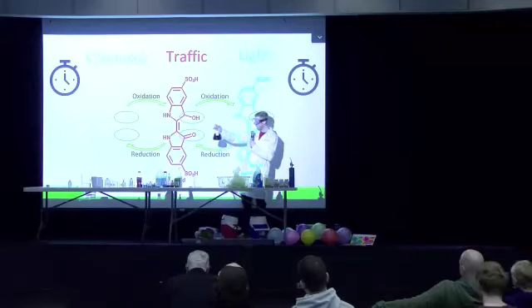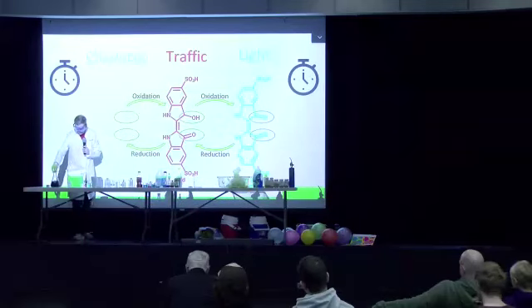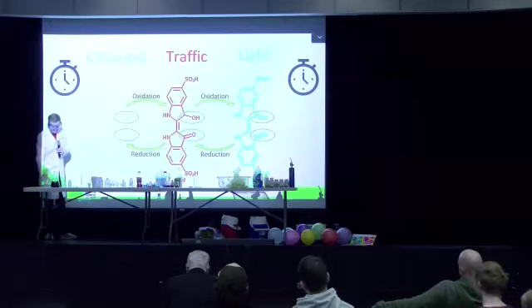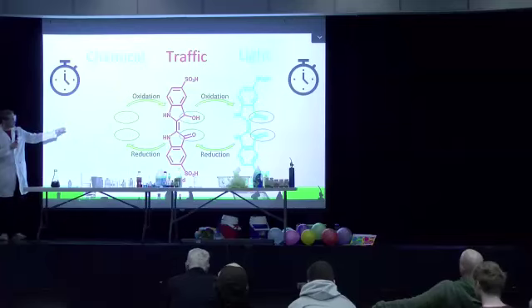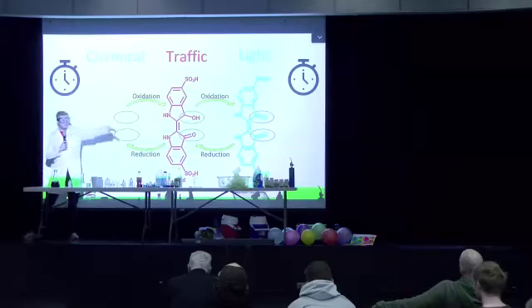So when we shake it, we get green. I'll let it sit for a little while. And then it will go over to the red and then go over to the yellow. And then we shake it again and it will go back fast.